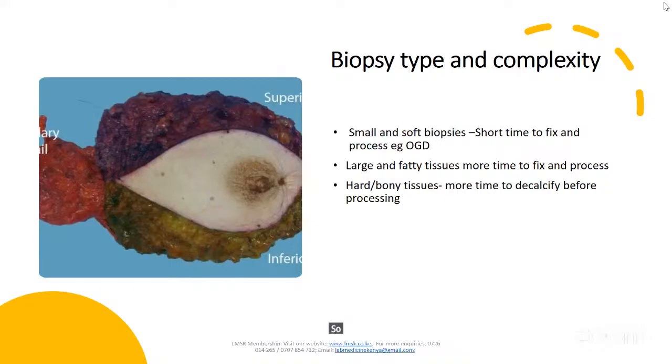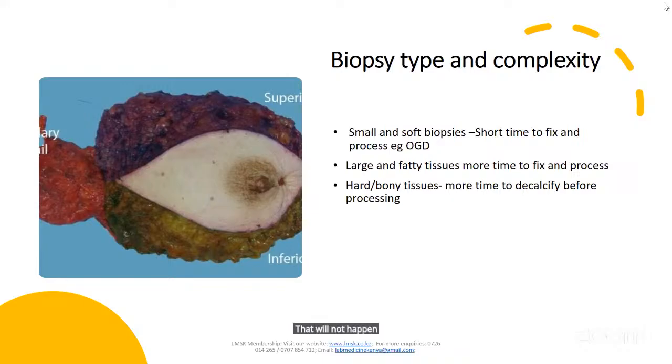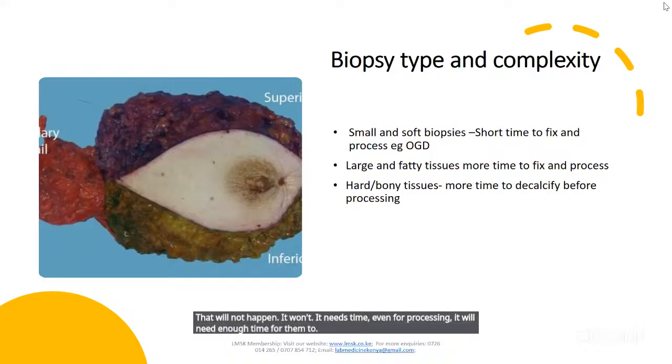So large and fatty tissues, of course, will take more time to fix and process. And this one, I cannot lie to you that someone will tell you that after a mastectomy has been taken, it will take 8 hours to give you the results. That will not happen. It won't. It needs time. Even for processing, it will need enough time.